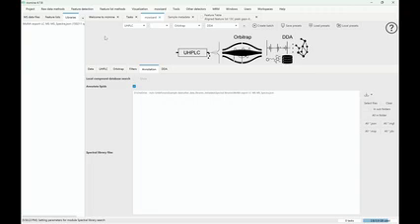Okay. Yeah, so I guess with the NIST, we're still working out with them some ways of directly using NIST also in mzmine. There is a module, but it's quite old, and we don't currently get the spectra out, so we cannot basically show you the quality. No, the module is good, but there is an issue with the matching factor.